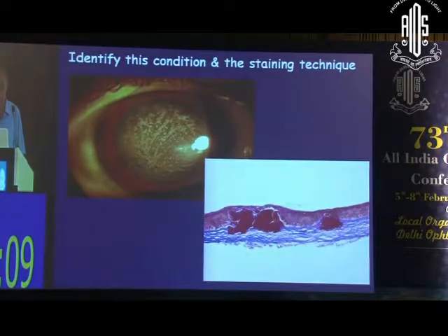And this is how Microsporidia look on a 1% ZN stain. That's the high mag view. Okay, they appear acid fast. Okay, that's a Cadbury question. Now people who are at eye focus, please don't answer.